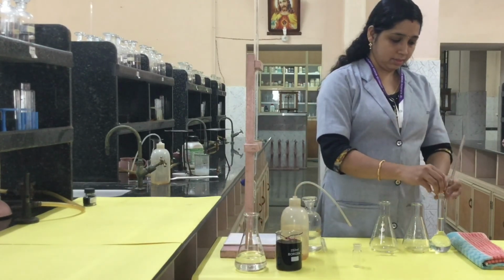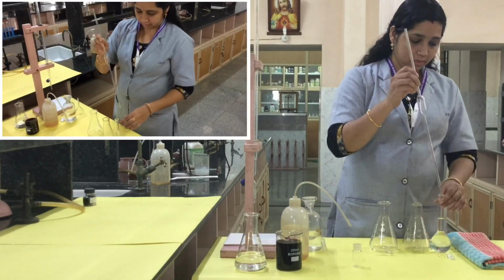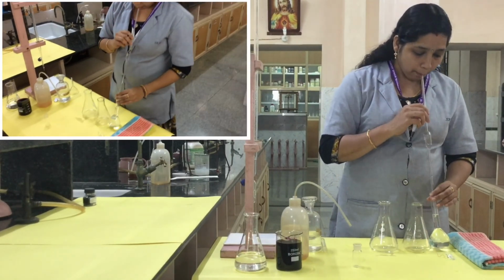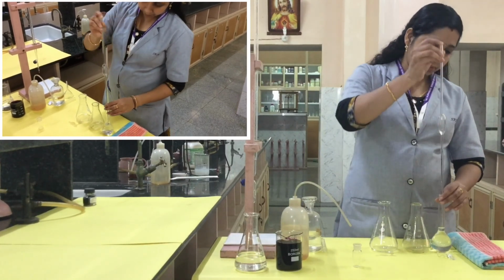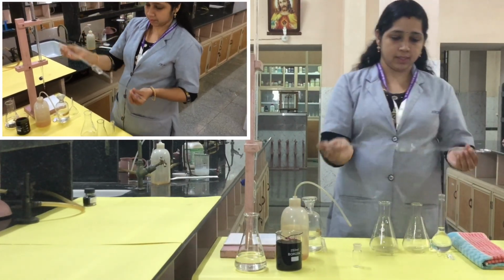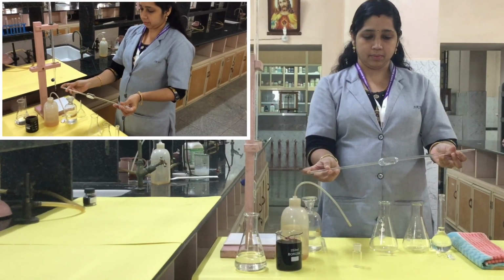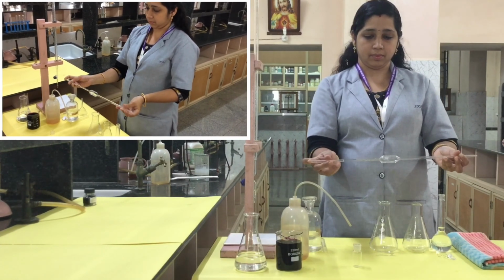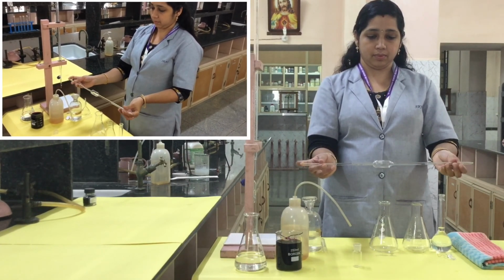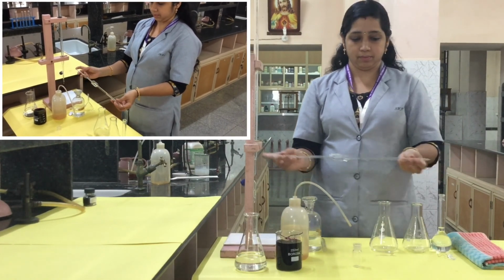So first we rinse the pipette with water. Now we have to rinse it with the standard solution of Mohr salt, since we are pipetting this standard solution. So before that, you just want to rinse this pipette with Mohr salt. Just pipette out 2 or 3 ml of this Mohr salt and rinse the pipette with it. Here you can see this pipette is rinsed with the Mohr salt. Yes, now it is rinsed.